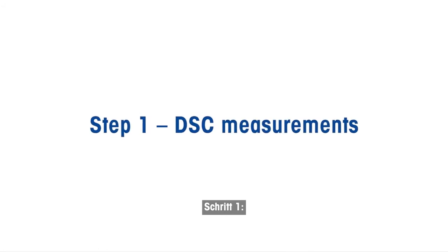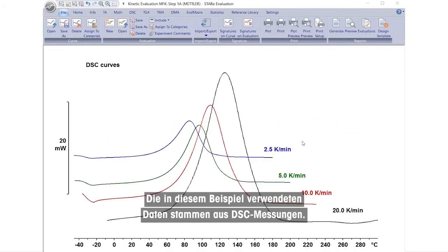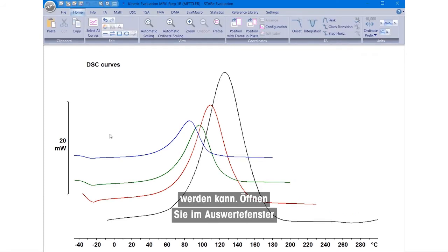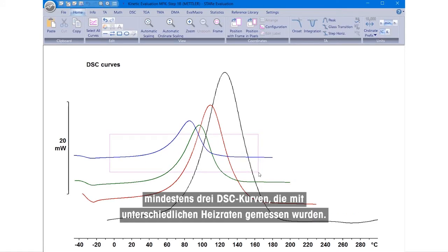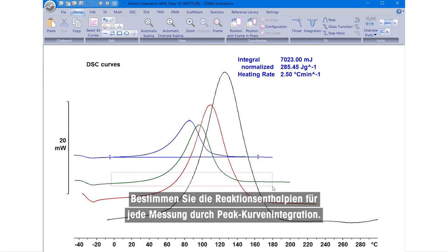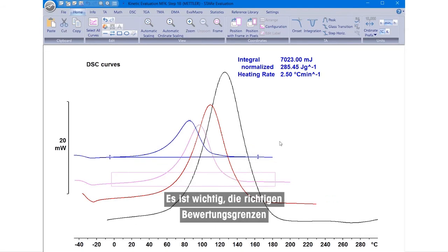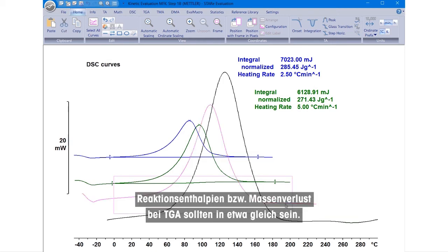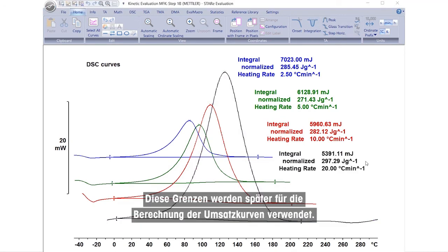Step 1. The data used in this example originates from DSC measurements, although the same procedure can also be used for TGA. Open at least three DSC curves measured at different heating rates in the evaluation window. Determine the reaction enthalpies for each measurement by peak curve integration. It is important to select the correct evaluation limits and baseline type. The reaction enthalpies, or mass loss in the case of TGA, should be more or less equal. These limits are later used to calculate the conversion curves.